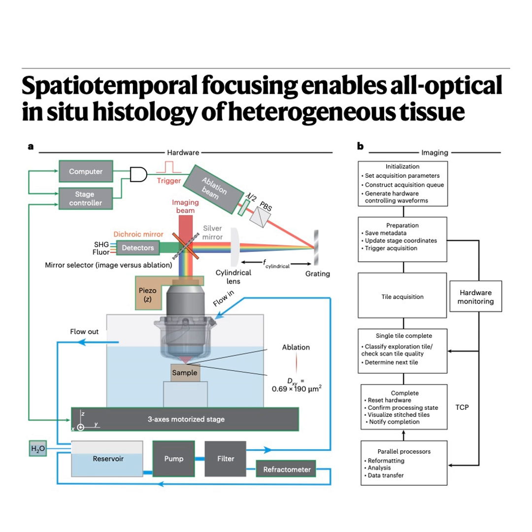Exactly. And that leads straight into the second wall, the classic trade-off between resolution and scale. You need that super fine submicrometer resolution to see the details. But to get that across a large volume, you typically need to section the sample, cut it into thin slices iteratively. And that's where the problems start with heterogeneous tissue. Absolutely. If you try using traditional methods like a mechanical microtome to cut both bone and soft tissue at the same time, forget it.